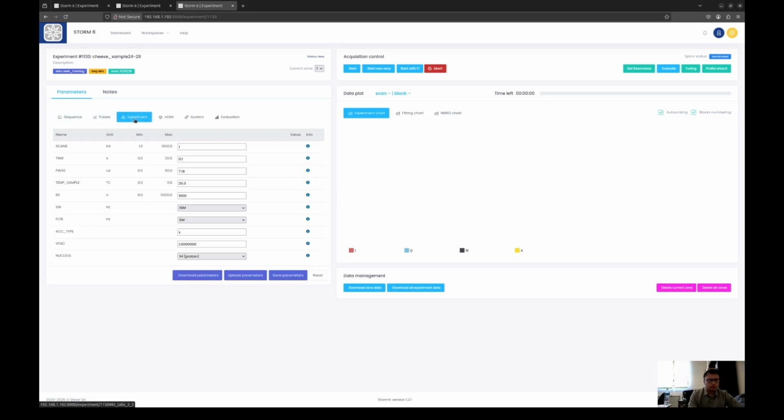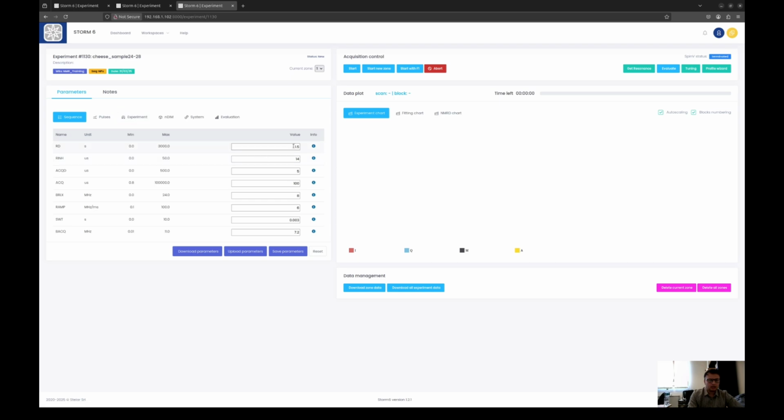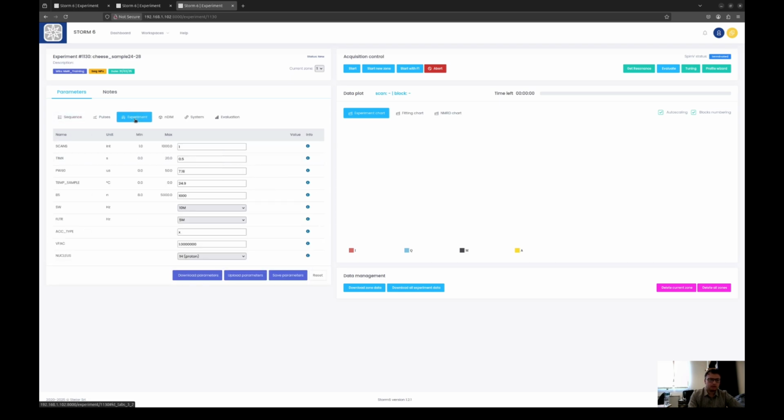So here I am writing 0.5 as the T1 value, so that's why I changed it to 1.5, but this will increase and decrease based on the T1 value of the sample which you want to measure or which you are using to perform experiments.